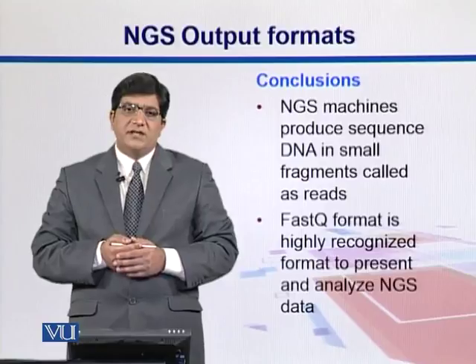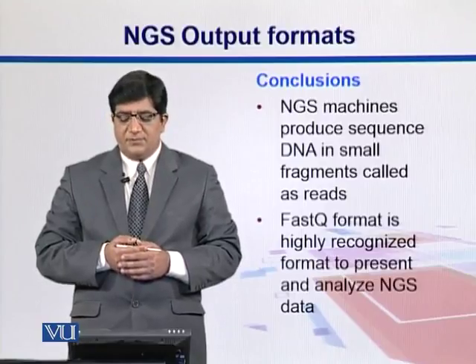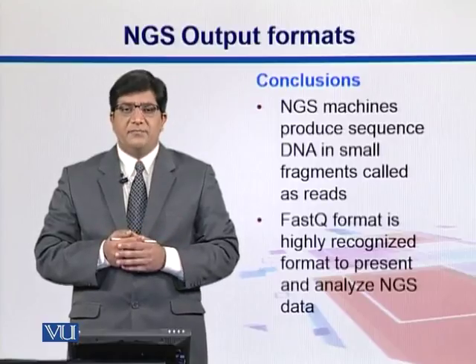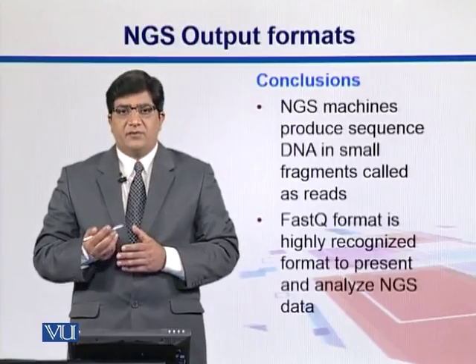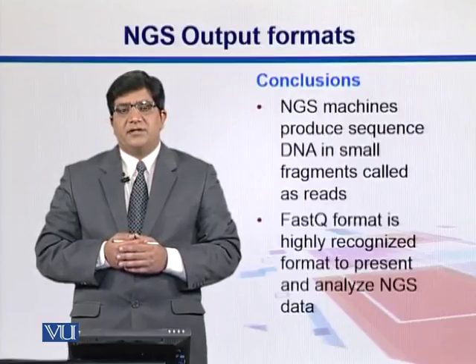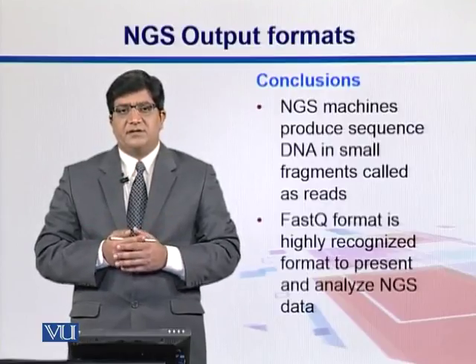So far what we have seen here is that NGS machines produce sequence data in the shape of small fragments. We call them reads, and there are different formats in which that data is presented, whereas FASTQ format is recognized as the standard amongst them.